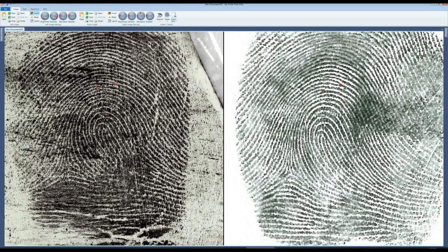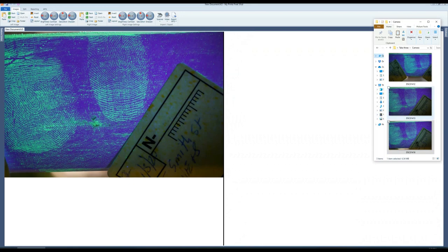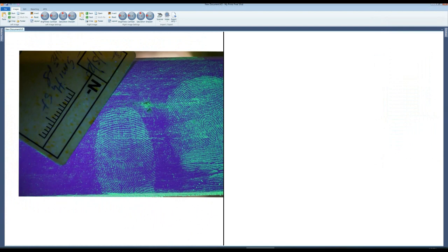Select the next image for comparison by drag and drop method. Position as required. Scale.